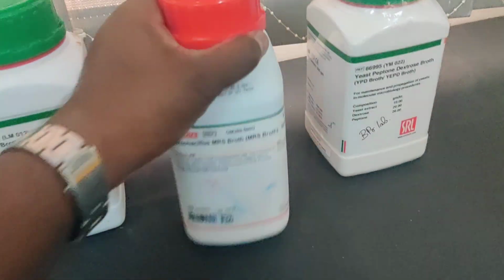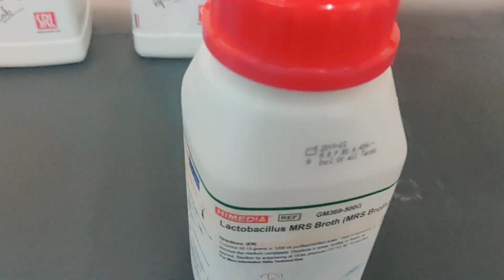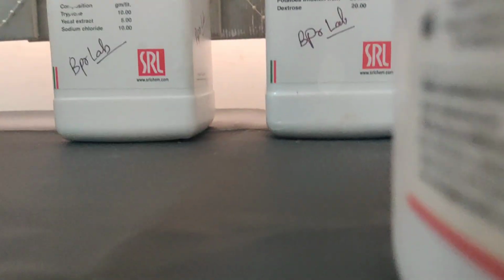Whereas the MRS broth, as I have told you, is in granulated form. So I will show you what granulated form is. Just a minute.